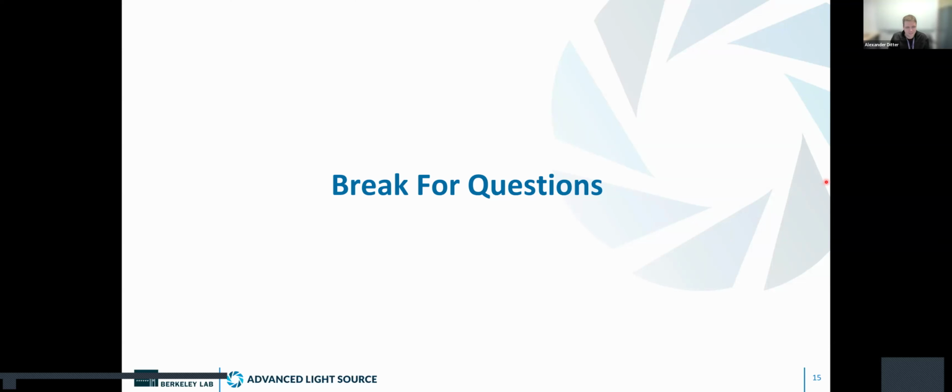Hi, Alexander. Really nice presentation so far. I was just wondering whether it's become customary at COSMIC to use defocused spot sizes. We found that to be very effective for reducing radiation damage and actually making the measurements somewhat faster. Yes, we definitely do defocus. Our normal spot size is 45 nanometers, and when we're doing ptychography, we typically run about 100 to 200 nanometers. Thank you. So yes, we definitely do that.